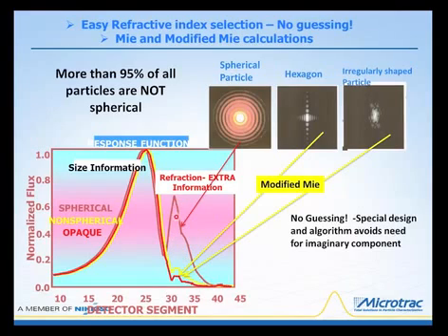But this has to be taken into account with spherical particles, because if it's not, it will show up as a secondary peak because the calculations will just run through that. So when we're talking about spherical particles, we are talking about true smooth spheres, and then you would pull in the spherical modeling, the spherical calculations to manage that whole situation.